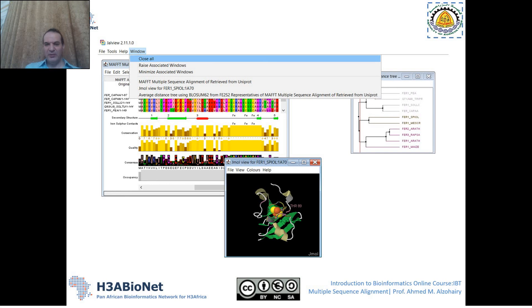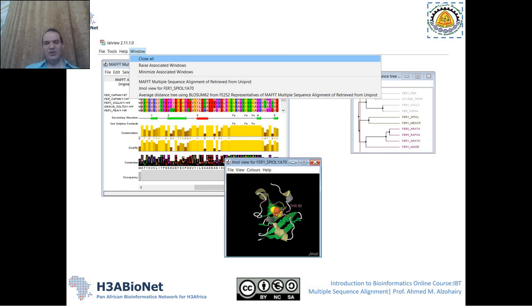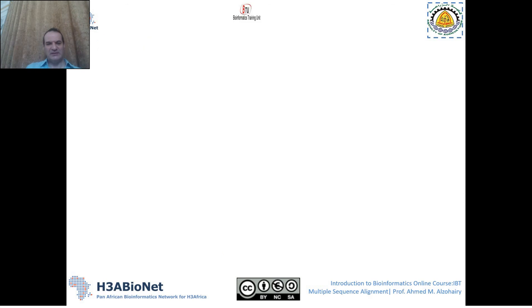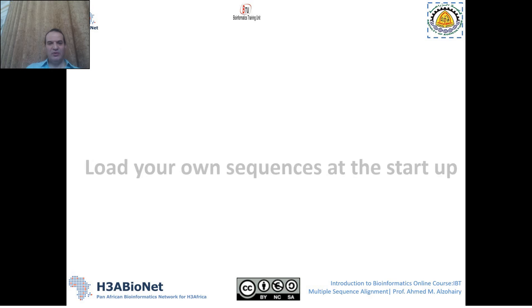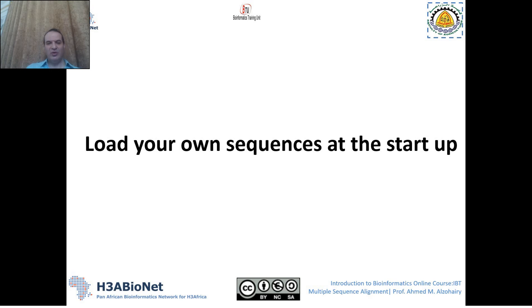If you would like to close all the windows that appear in this example, just go to the Window menu and press 'Close All.' This will close all the windows and give you space to start loading your own sequences.